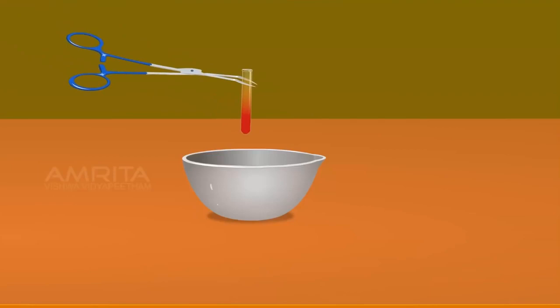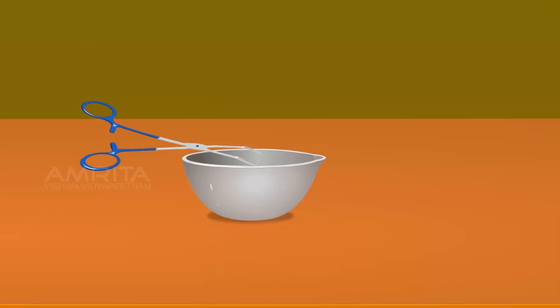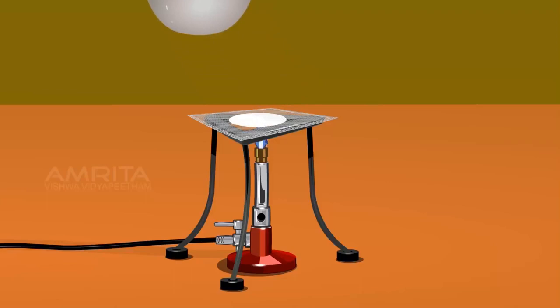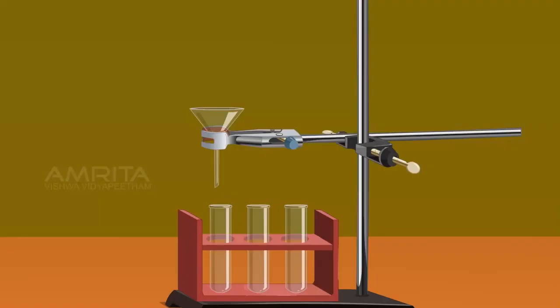Crush the tube with a glass rod. Repeat these processes 2–3 times and heat the contents of the China dish to boiling point for a few minutes. Stop heating when the volume of the liquid in the China dish is reduced to one third of its initial volume. Place filter paper in the funnel fixed to a stand and filter the contents of the China dish through the funnel into a clean test tube placed under the funnel. The filtrate is called Lassaigne's extract.